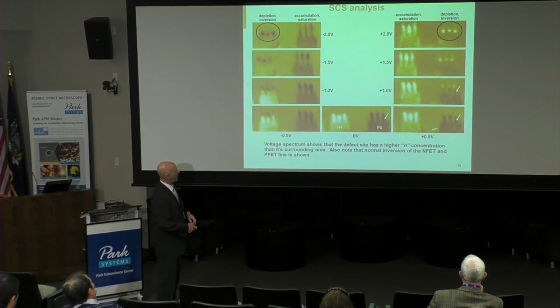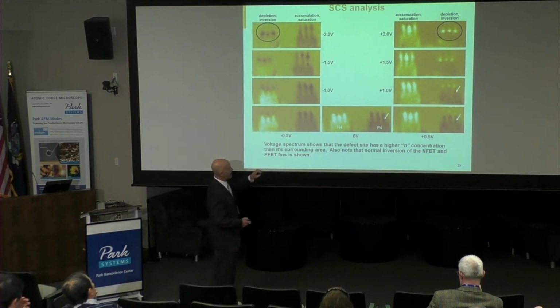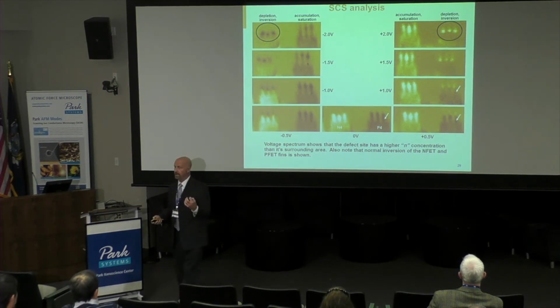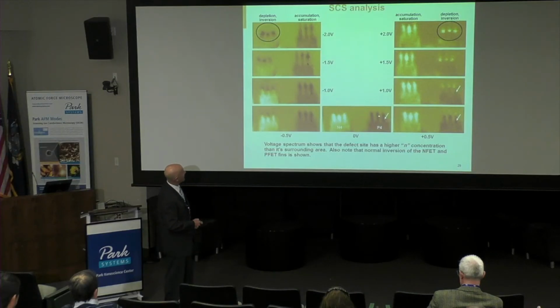So essentially, that's what we were out to get in this analysis: finding the root cause and the explanation for the fact that this device would leak, because we've got a high concentration of arsenic and phosphorus there that is providing a leakage path.